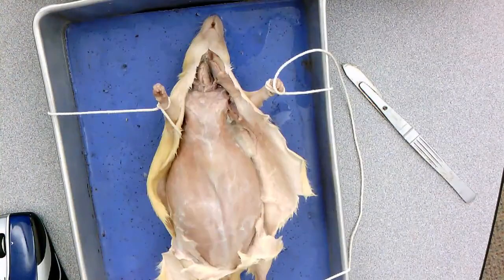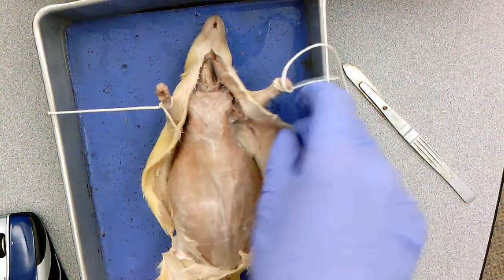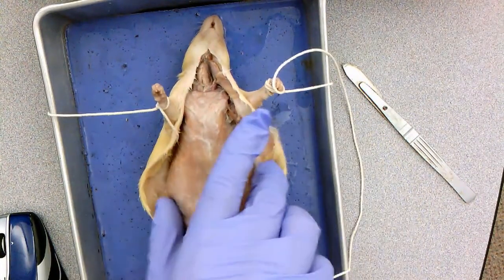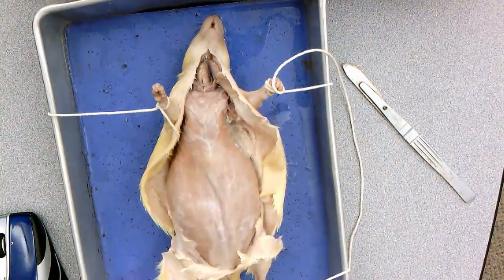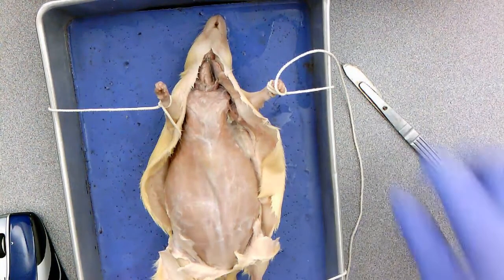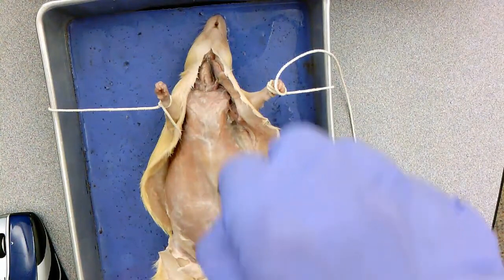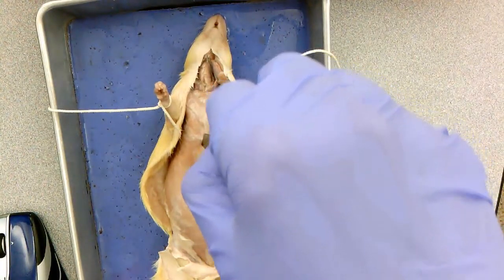All right, so now you can see that I have my rat. The rat has been skinned. I removed that skin from the rat. What you're going to want to do now is take a picture and upload that picture to Schoology for us to take a look at and grade, just to make sure that you did this correctly. Now you're going to make a cut from the pubic region. You're going to make an incision from this pubic region all the way up to the bottom of the rib cage.